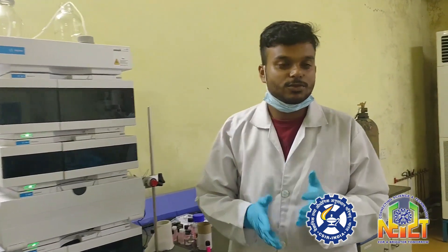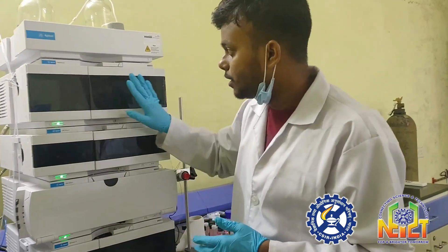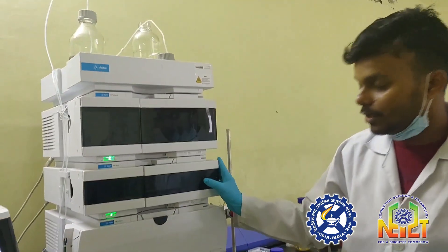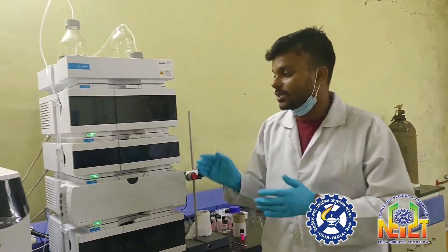After separation, all the fragments are detected by different detectors such as a refractive index detector and UV detectors. These detectors detect the fragments at different peaks. These are the previous chromatographic separations of polymers present in the sample.